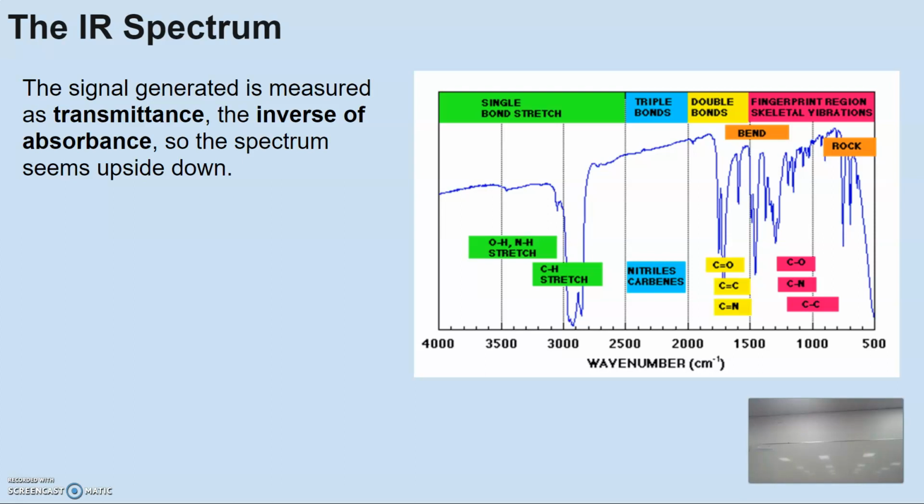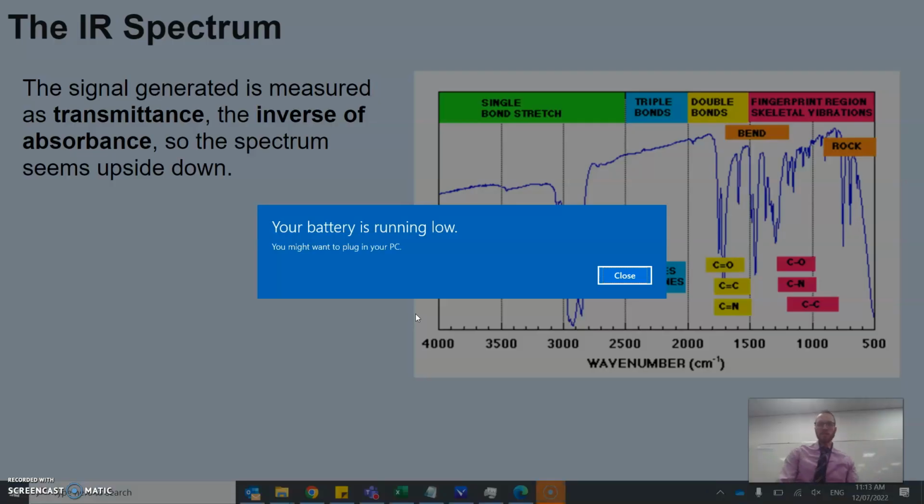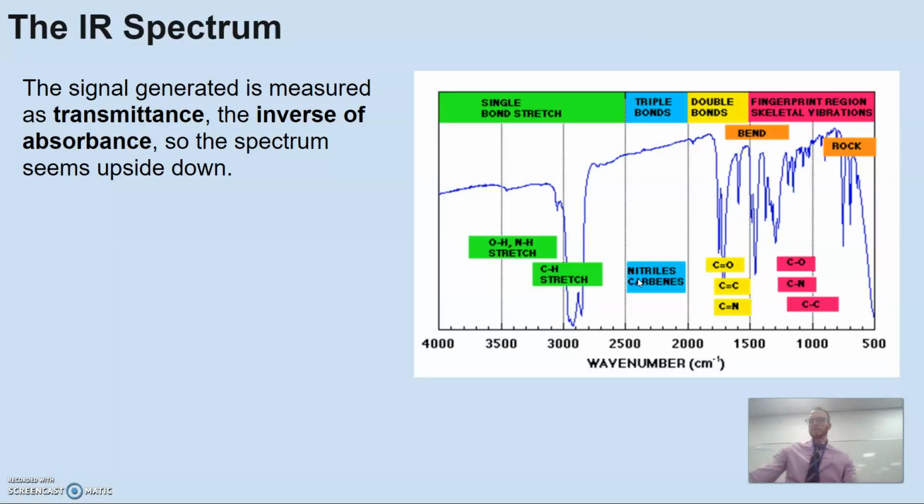So if I had this as wavelength, it would be 0 plus. Yeah? Not all that important. What's more important is interpreting this, right? Anything that's below around 1500, we can almost ignore. It's called the fingerprint region. It has a particular use that I'll talk about.